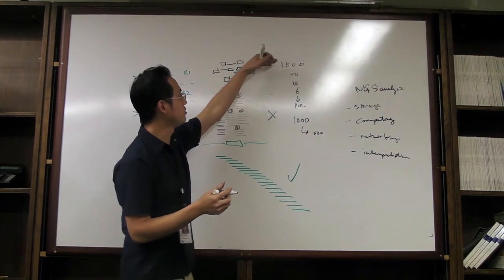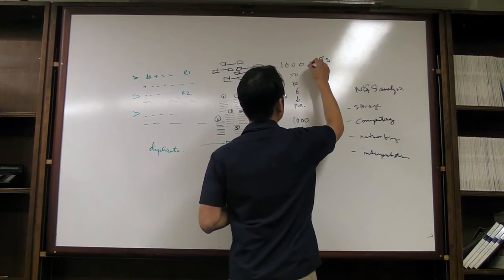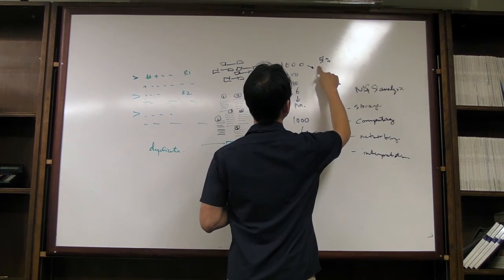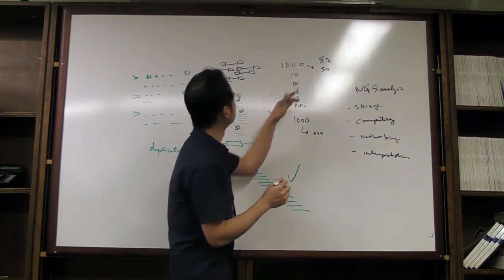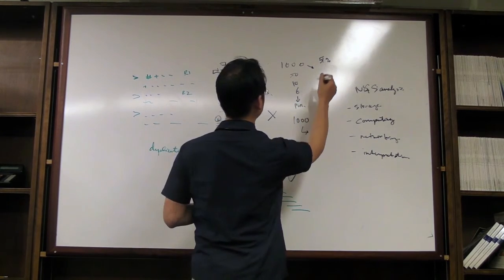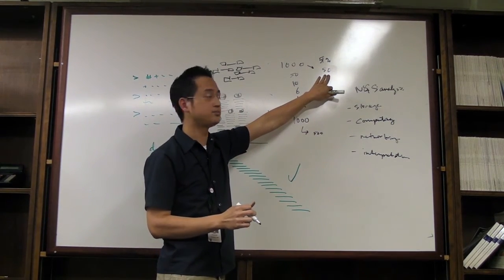So what happens is that if you have allele frequency down to 1%, or even let's just make it easier, 5%, you would expect that your mutation would occur about 50, right? Is that right? No. 20. 20 times, no, I'm right. 50, right? So you have 50 alleles that will contain your mutation.